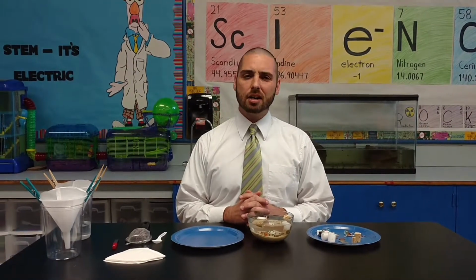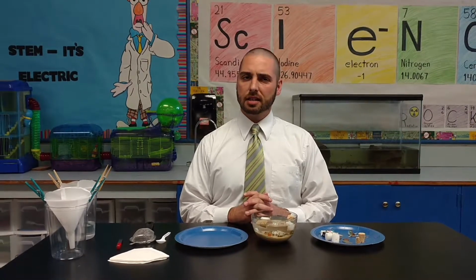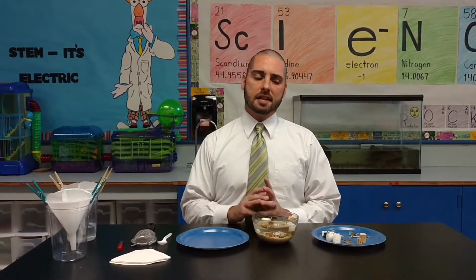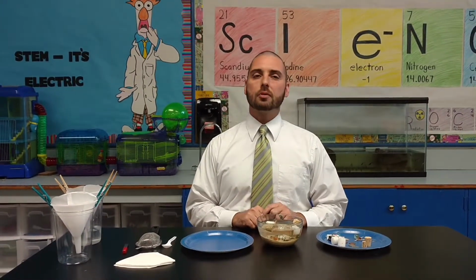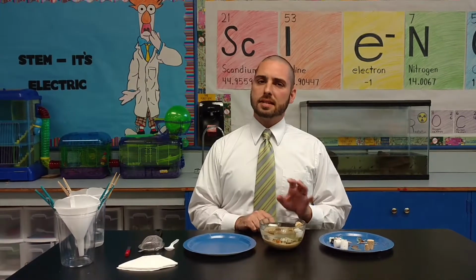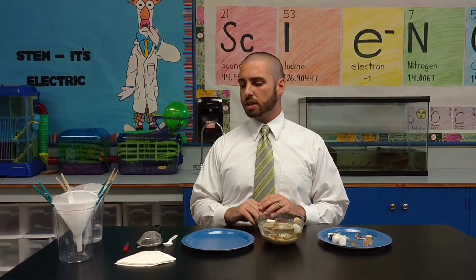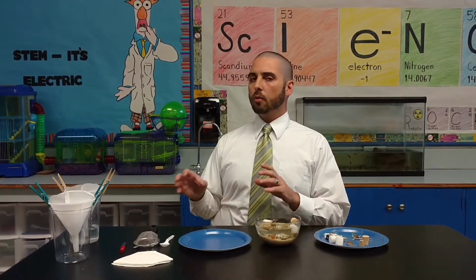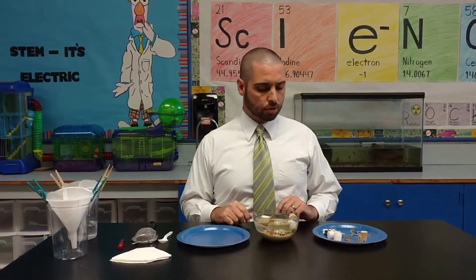Today we're going to be talking about mixtures and solutions. Now, in the state of South Carolina, we really began getting into mixtures and solutions in the 5th grade. That being the case, I've got a nice little lab set up for us so that we can explore specifically separation techniques. Now this could be an activity that you use to introduce a number of tools that one can use, or it might be a way to review tools that you have already introduced to your students.